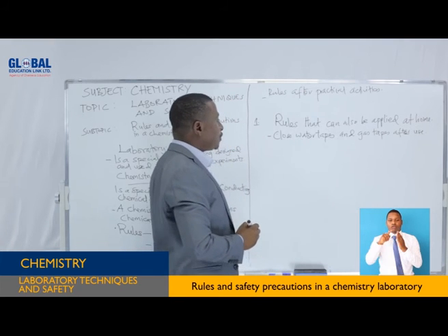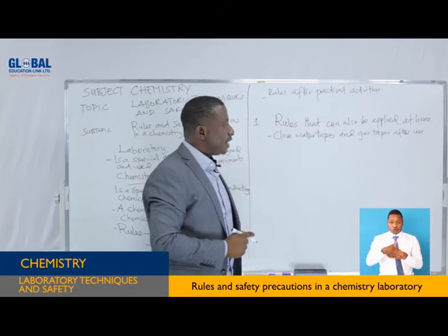Rule number 1, close water taps and gas taps after use.